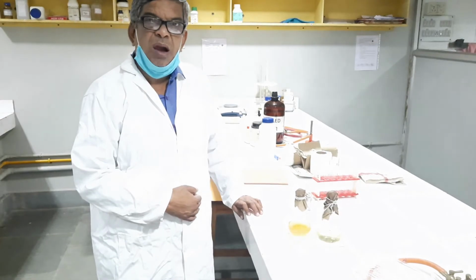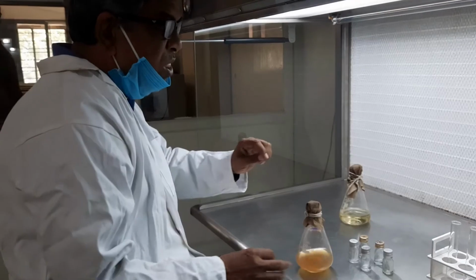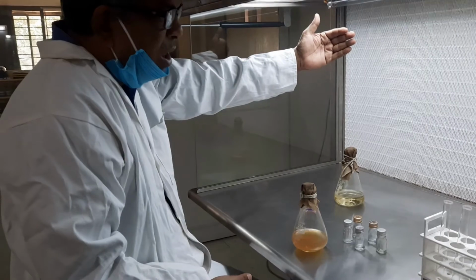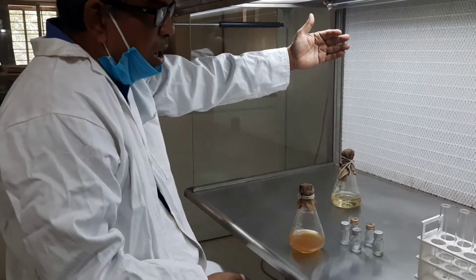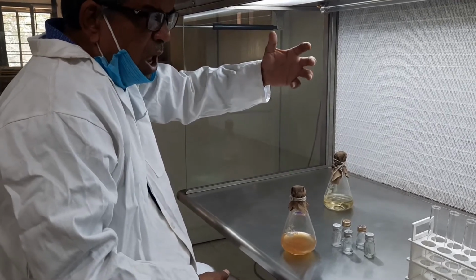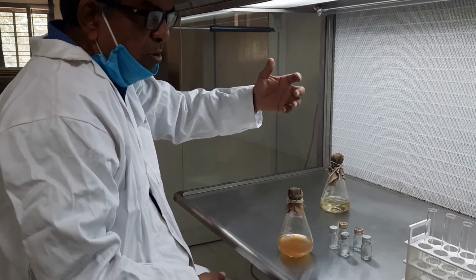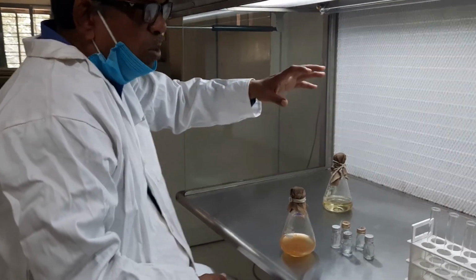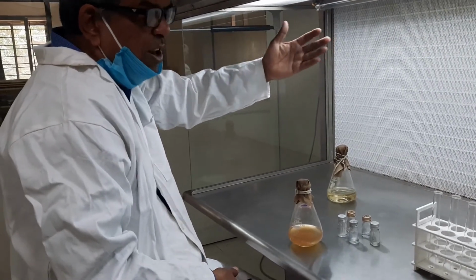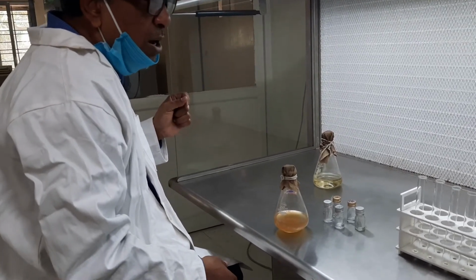Right? Thank you. Students, I have sterilized my hands with isopropyl alcohol, and it is a laminar hood. Here a HEPA filter is there, and the incoming forced air is having particles less than 0.22 micron. You'll study in pharmaceutics the calibration and validation of this HEPA, high efficiency particulate air filter.